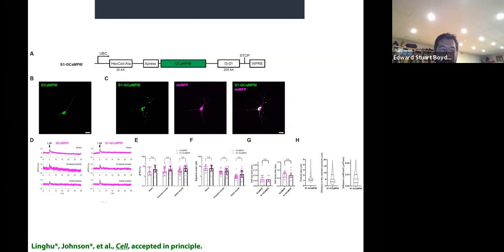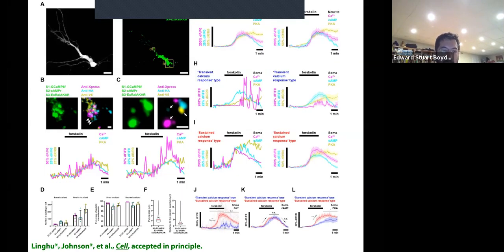So now we can make lots of these, right? There are hundreds of fluorescent indicators out there. What if we could fuse all of them to different self-assembling peptide sets? This is a crowded slide, but just focus on where my mouse is pointing in the upper left. Here you can see in panel A a cell that's full of green dots. Let's zoom in to the yellow squares. In panel C, for example, we'll zoom in below. And you can see a couple green dots.